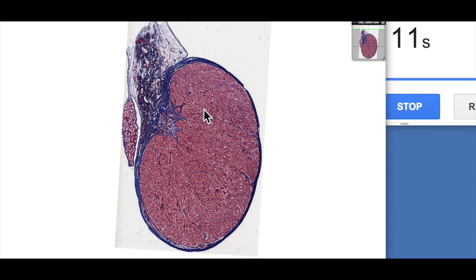We've got the mediastinum of the testis here. The tunica albuginea forming the septa, which divides the testis into lobules. And within each of the lobules we find the seminiferous tubules. We'll talk more about the rest of the structure in a different video.